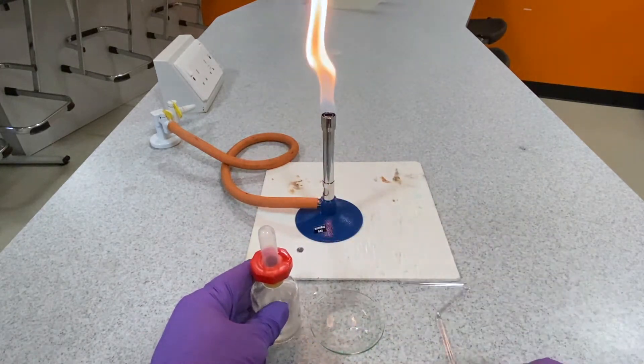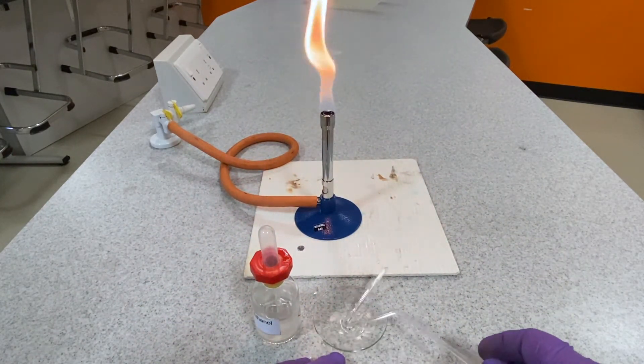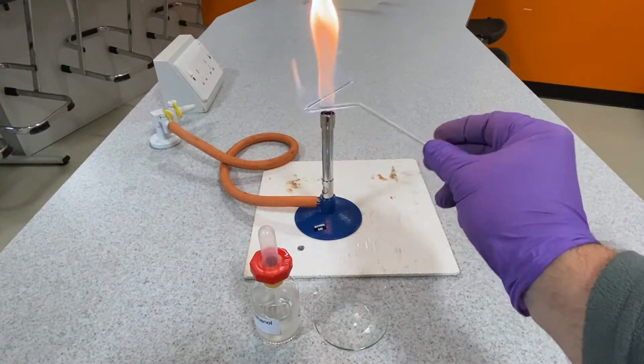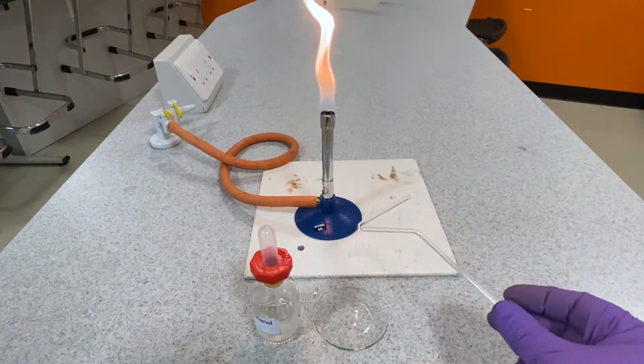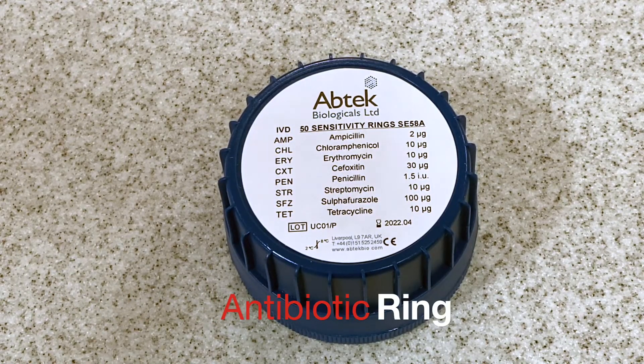As an alternative to the disposable spreader, a glass spreader can be used. This is sterilized in the following manner using ethanol and a watch glass. Once the glass spreader has been dipped in ethanol, it's passed through the Bunsen flame and the ethanol is burnt off, thus sterilizing the glass spreader.